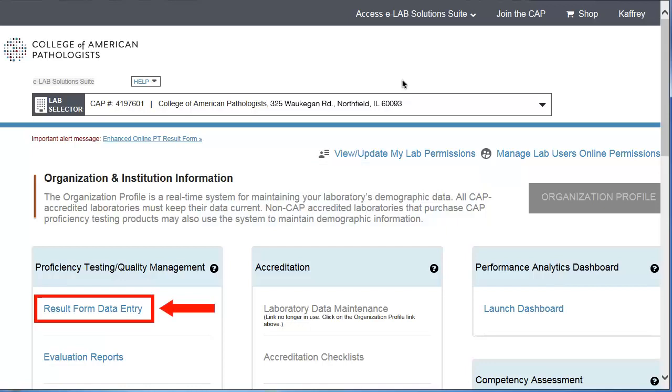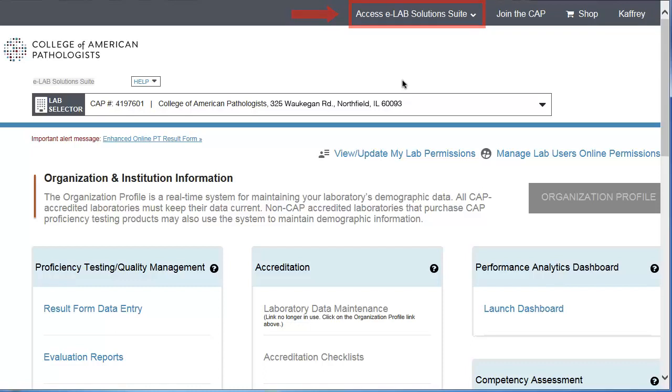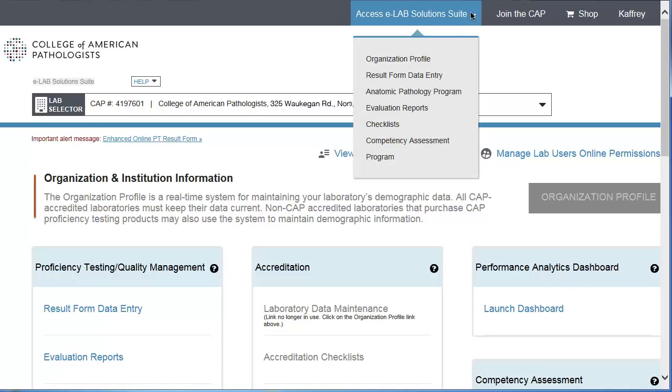You can either click the link on the eLab Solutions Suite main page, or use the Access eLab Solutions Suite menu link. Hover your mouse over the menu button to open the menu, and then click Result Form Data Entry.